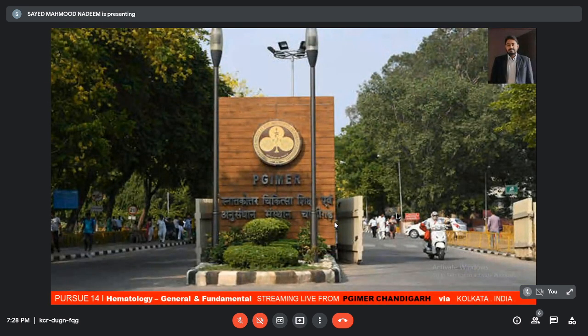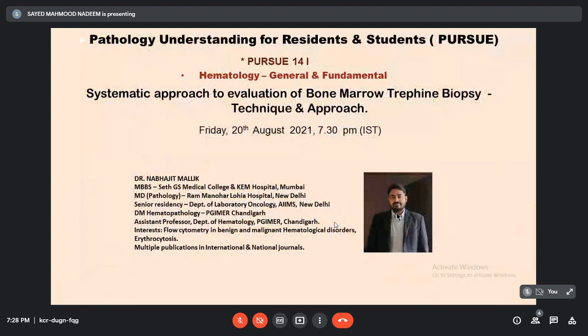Good evening, everybody. Welcome to this evening episode of Pursue. This is Pursue 14I, which is Hematology General and Fundamental. We are streaming live from PGI Chandigarh via Kolkata. And we have a very basic, very essential and very important topic, which is systematic approach to evaluation of bone marrow trephine biopsy, technique and approach.